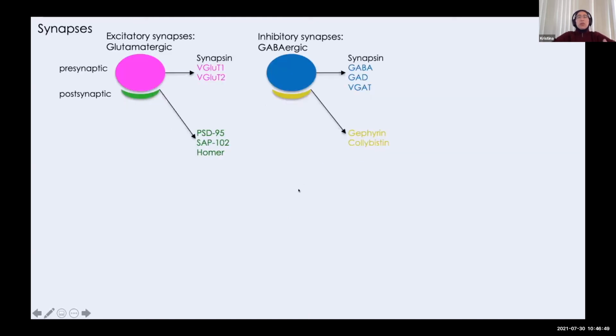Usually the way our strategy works in this case is, first one needs to develop a set of marker antibodies that will help you identify in your tissue the different compartments. Then one can judge where the antibody that you're testing is actually distributed.